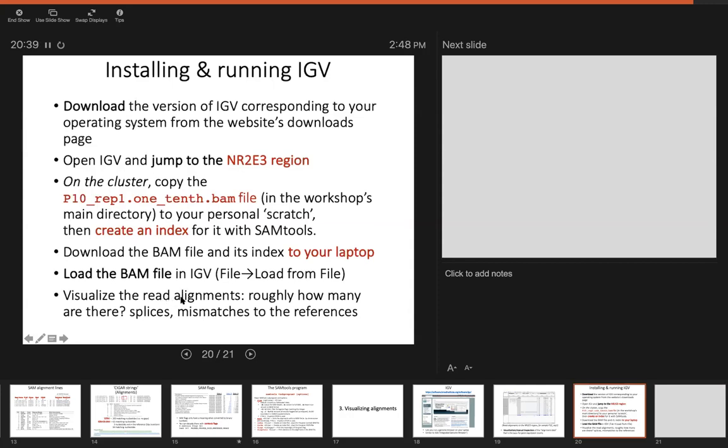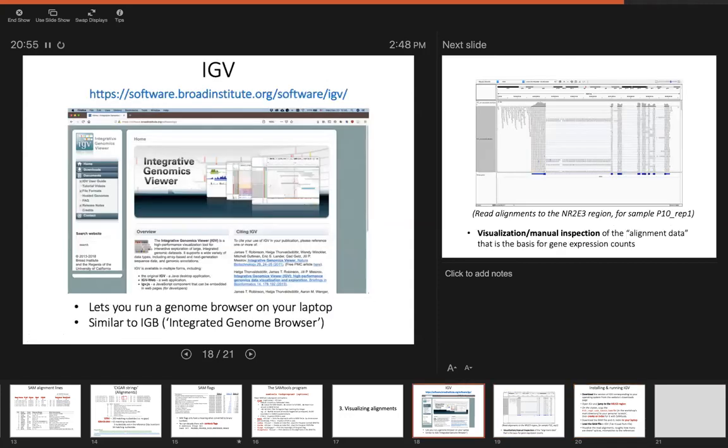And then just visualize the alignment data. I thought it was better for you to just visualize what the alignments were, and then we can produce our own alignment tomorrow and produce counts as well. So this is one of the BAM files I have produced from this data, and tomorrow we're going to. This is just one of the files.